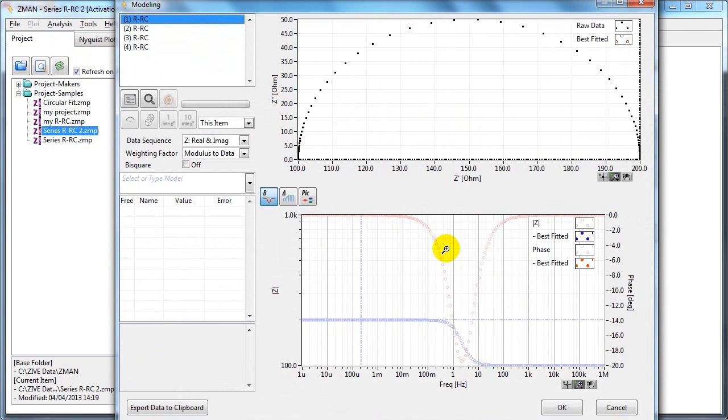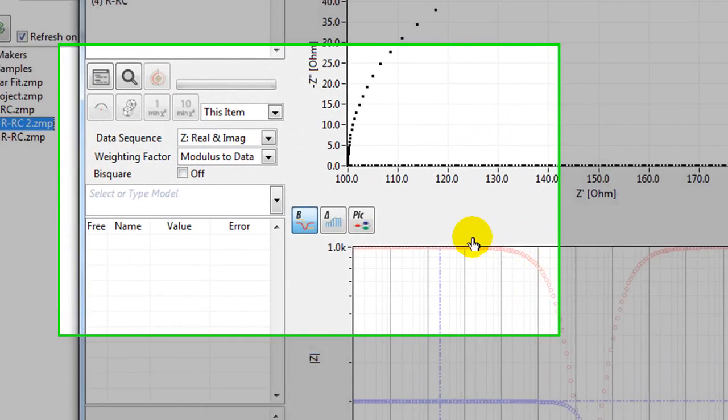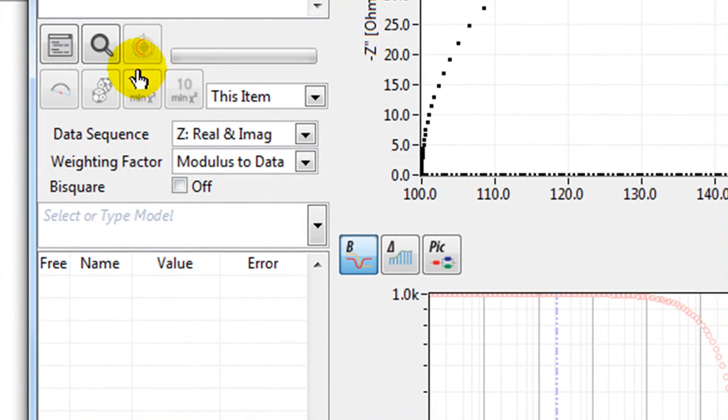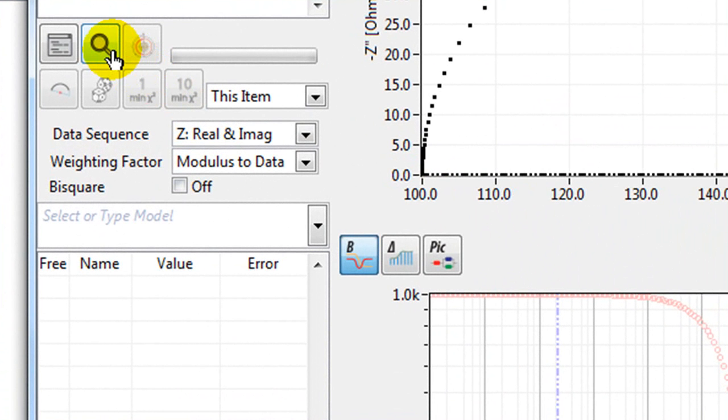If you don't know what equivalent circuit to use, what model to use, you can use the automatic search. We'll cover this later.